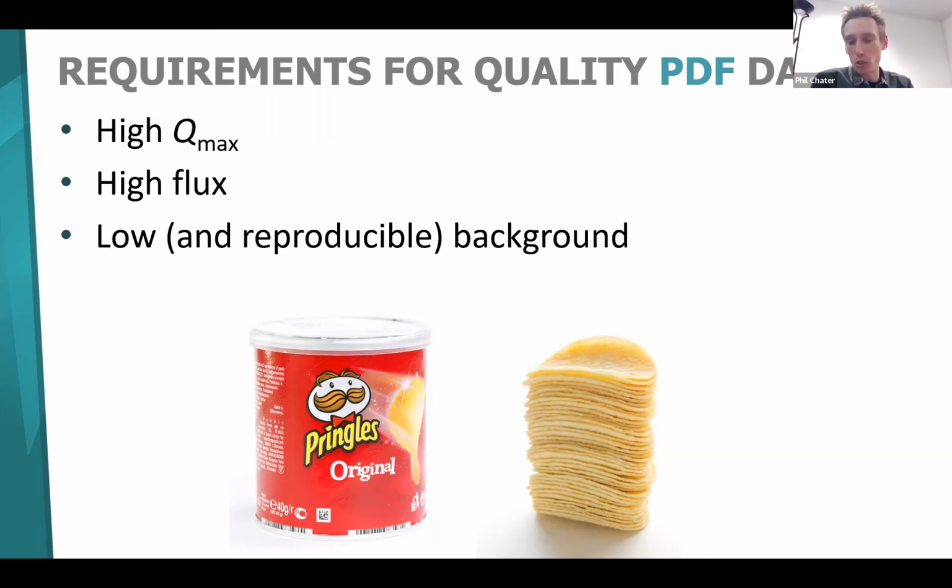If you have ideas for in situ experiments, give us as much notice as possible so we can do the work and testing to make sure that we'll get not only data, but good quality data by having this reproducible and ideally low background.